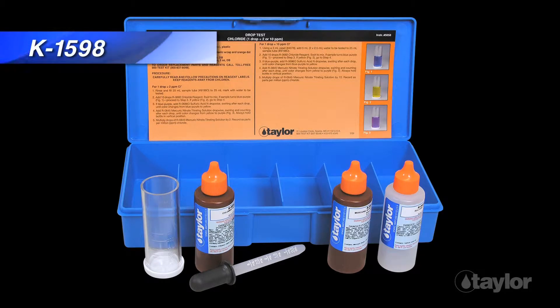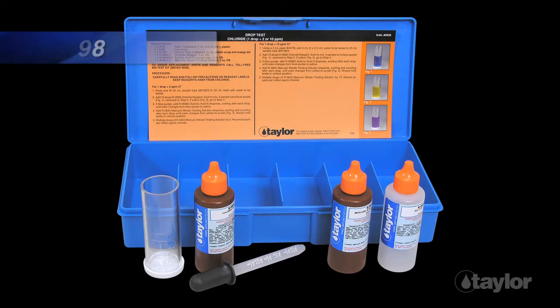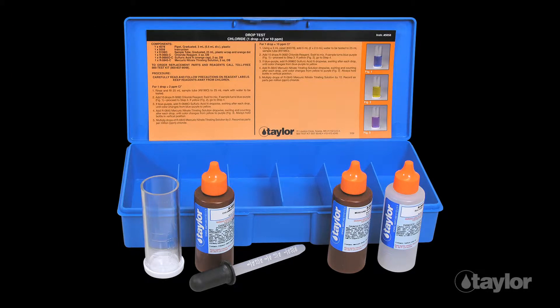The K1598 comes complete with all the reagents and equipment necessary for performing a drop test to determine chloride levels.